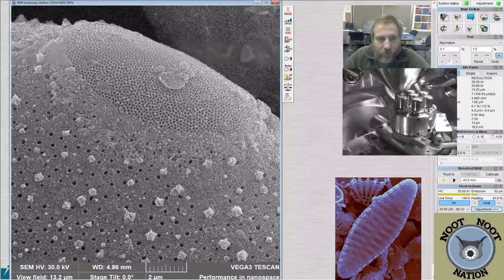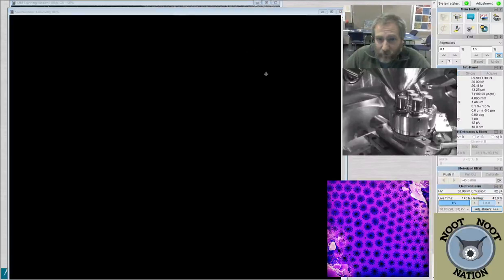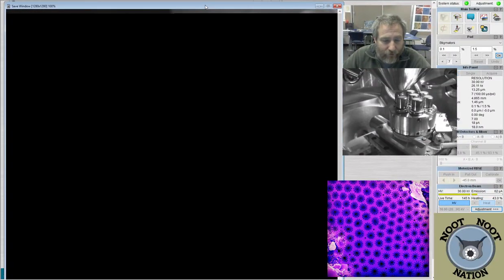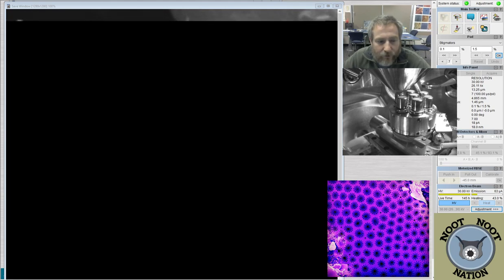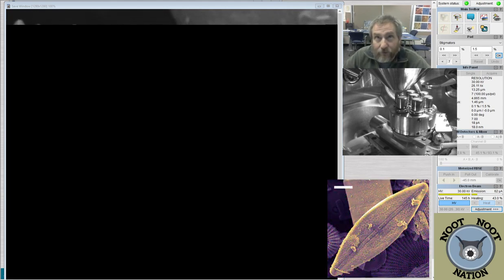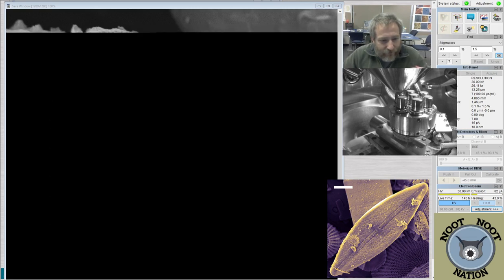So currently we're at around 21,000 times magnification, so about 3 times higher than we were when we were looking at that other aspect of it, when I was talking about 7,000 times magnification.